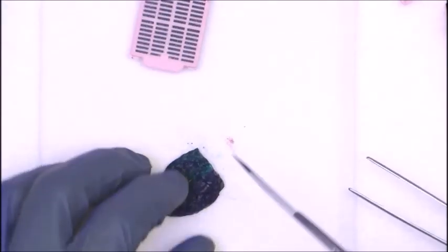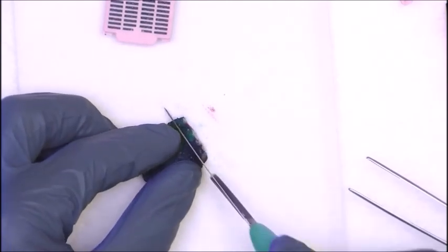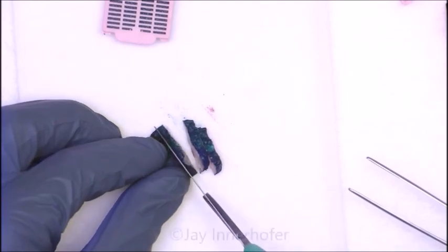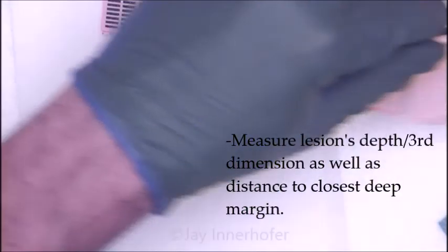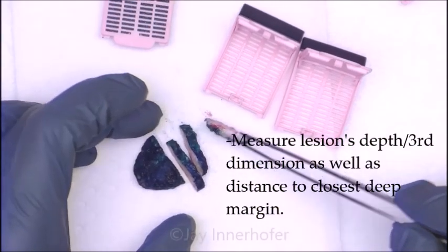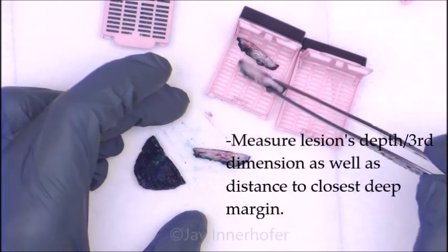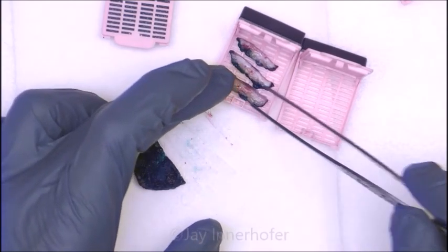Remember, we're sectioning this from 12 to 6 and submitting it entirely, okay? I'm going to do one more block. And I don't usually talk about the cut surfaces on skin ellipses. It's really a histological diagnosis as far as the depth goes, or grading.